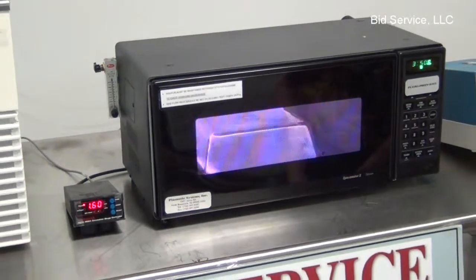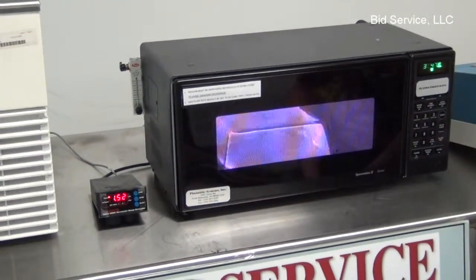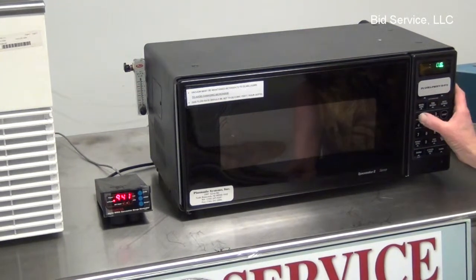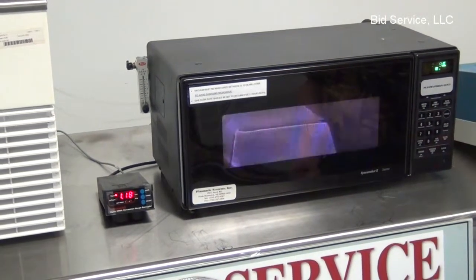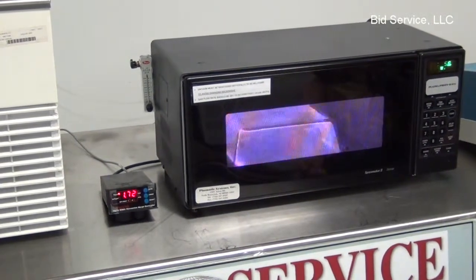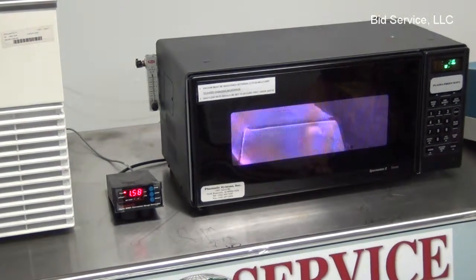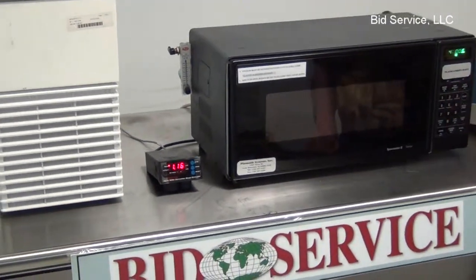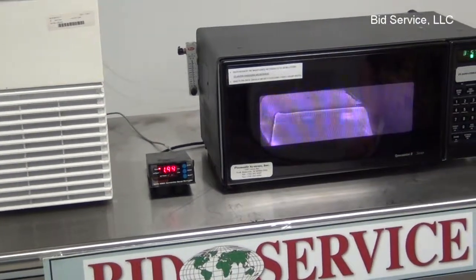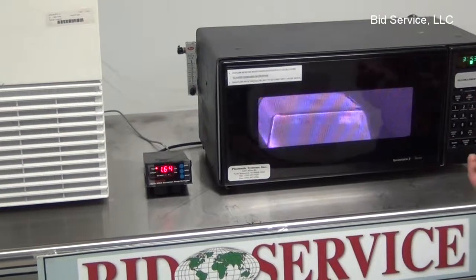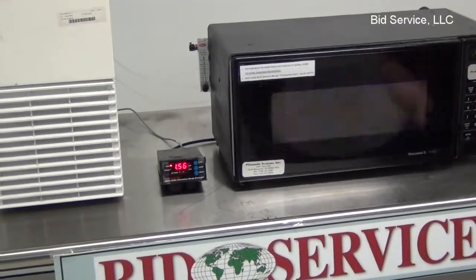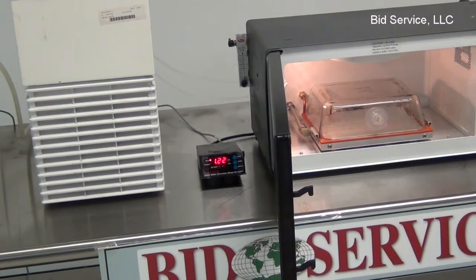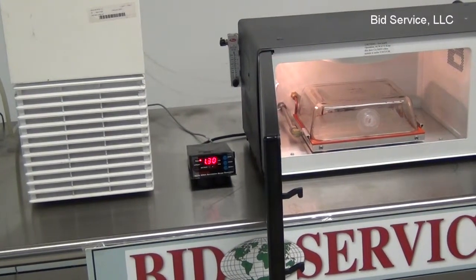Now, there are some special safety features about this. For example, let's say the cycle was completed and it stopped as normal. Let's say you put in 10 seconds. It turns off as normal as any microwave would. But let's say, for example, somebody inadvertently had it on and then said, oh, it's time for me to take my product out or something, and they went to open the door. Immediately, the microwave radiation would be shut off. So there's no possible way that you could have accidental exposure to the actual microwave radiation.